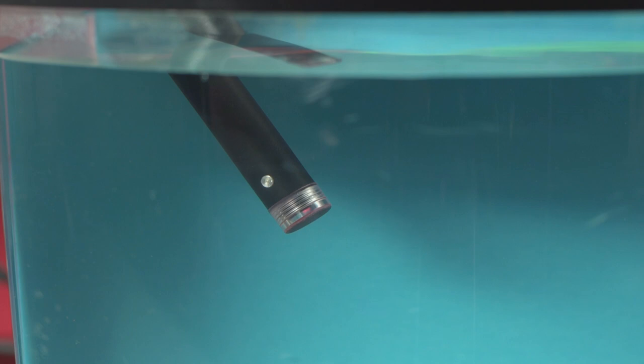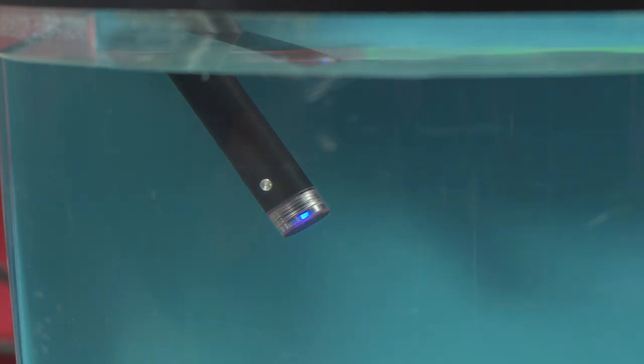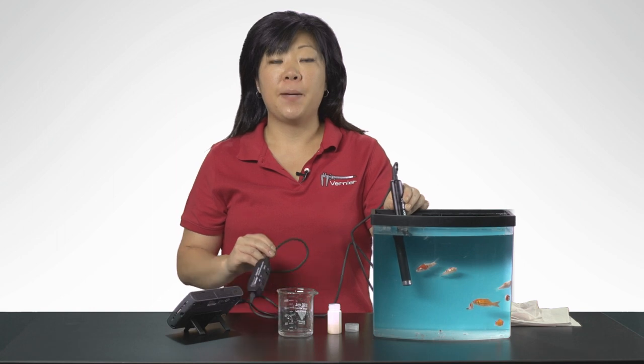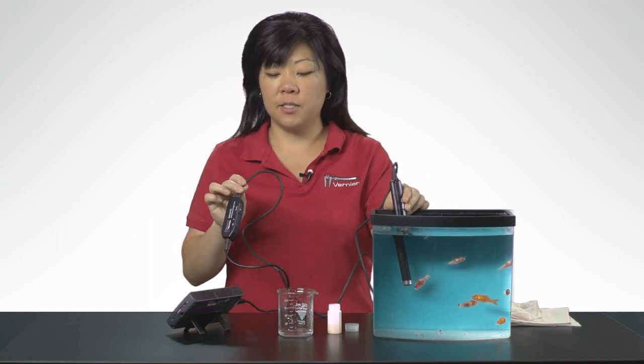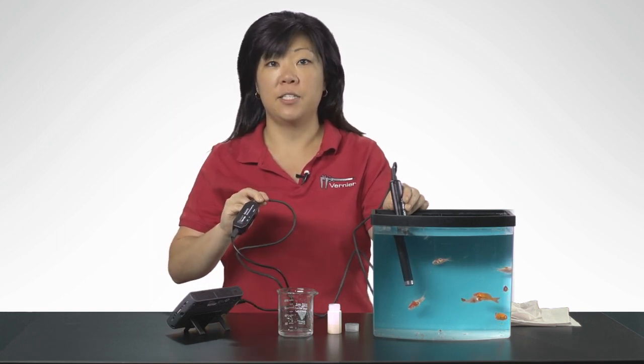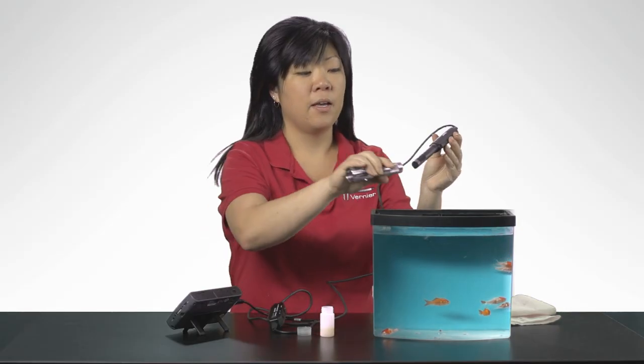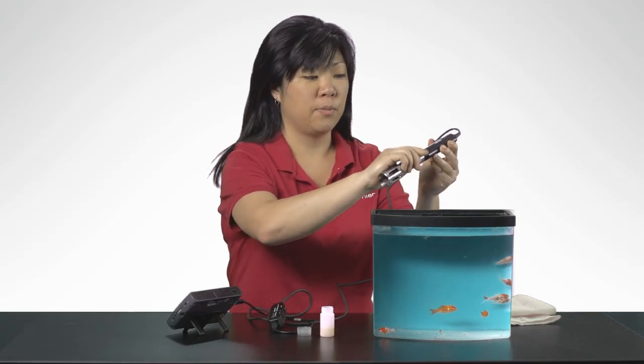The optical DO probe is designed so that it can be submerged in a water environment for extended periods of time. The body of the probe and cable are waterproof, but the box containing the microSD card is not. If you are taking measurements in the field, you may want to purchase the optical DO metal guard accessory to protect the cap and help weigh down the probe when submerged.